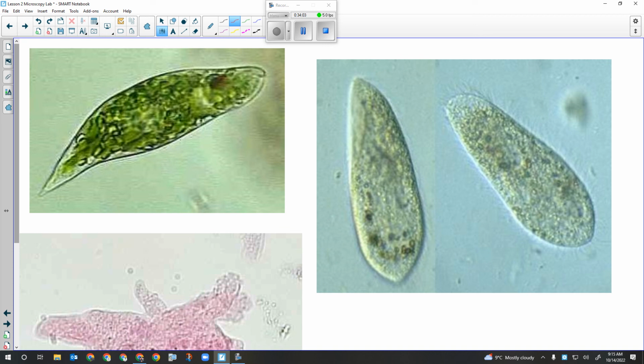Because before they divide, they can actually exchange a small little nucleus that has some genetic material in it. That can allow them to have genetic diversity instead of making an exact copy of themselves. They can exchange DNA with another paramecium, and then their offspring would be slightly different. So they have different colors because of that.